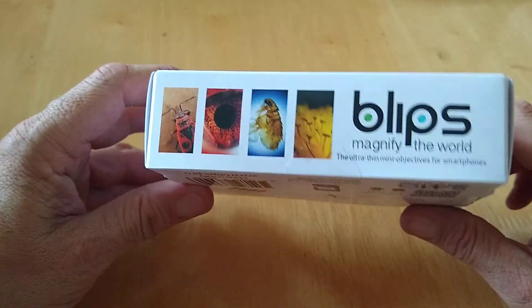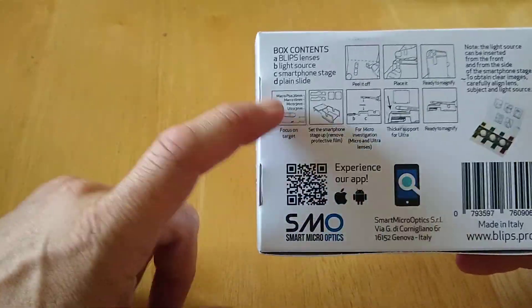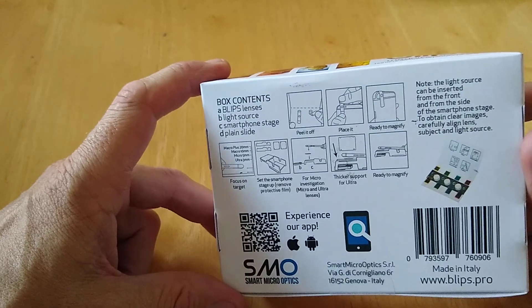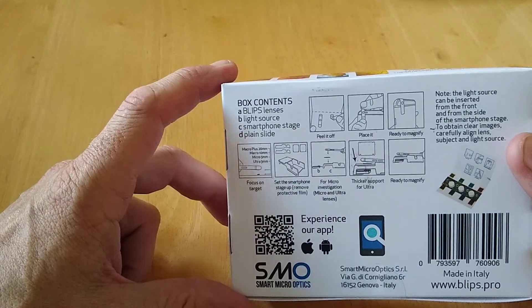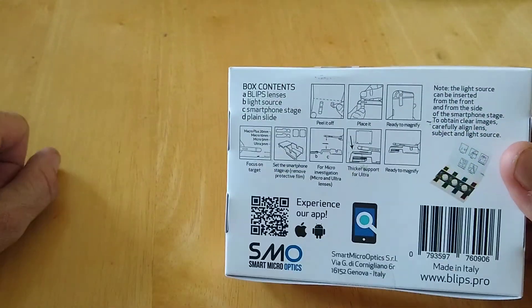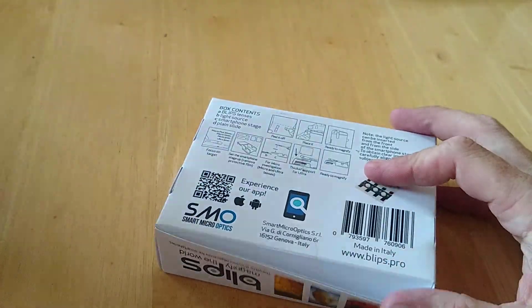It gives us some images on the side and on the back, and then it gives us the box contents. There's an app for Android and iOS, and a light source comes with it. It also gives you instructions on how to set it up, so let's check it out.